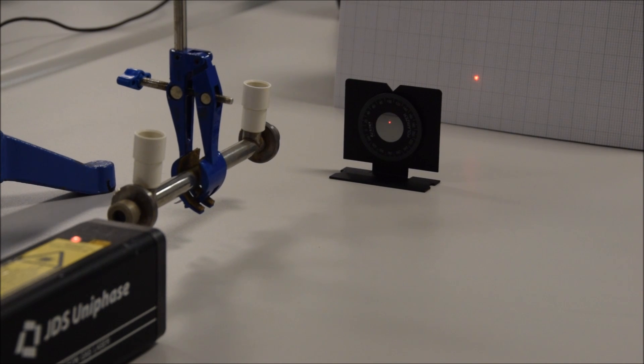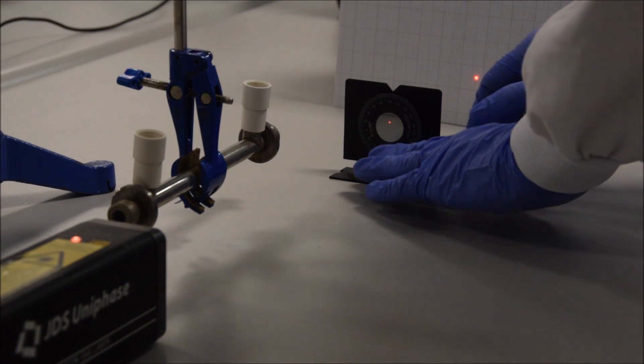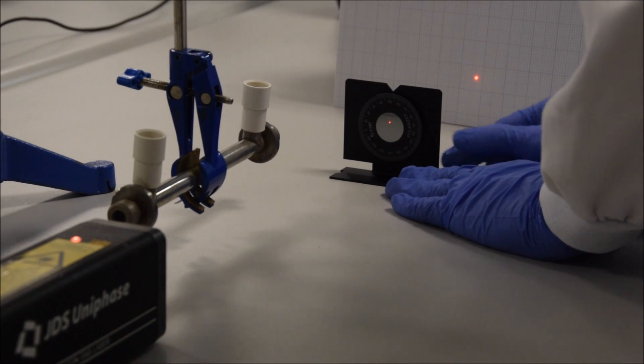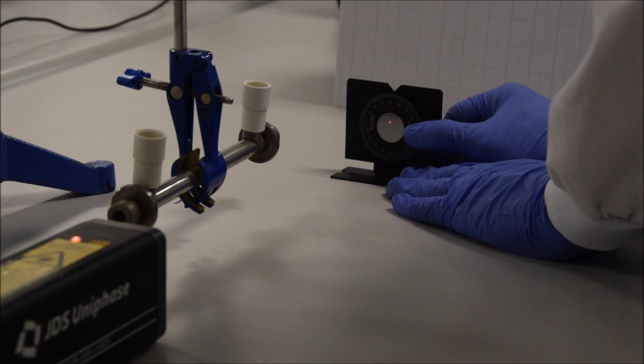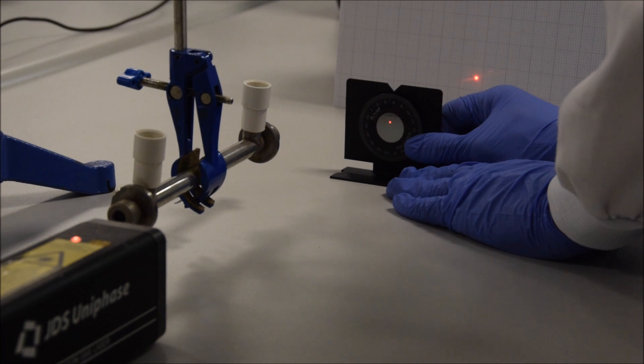Now let's try and figure out what was going on inside the machine. To demonstrate the effect outside the machine, I have a helium neon laser which is polarized. This means that all of the waves of light are oscillating in the same direction. The other thing I have is a piece of polarized material. When I rotate it, at some angles when the polarization of the light and the polarization of the piece of material are at 90 degrees to each other, all of the light is absorbed.